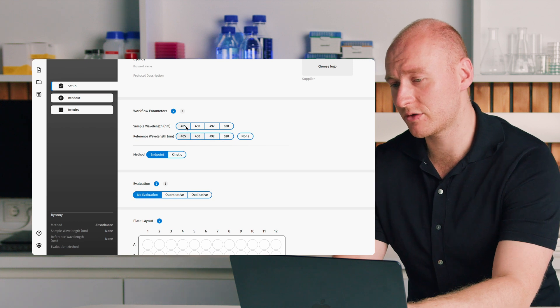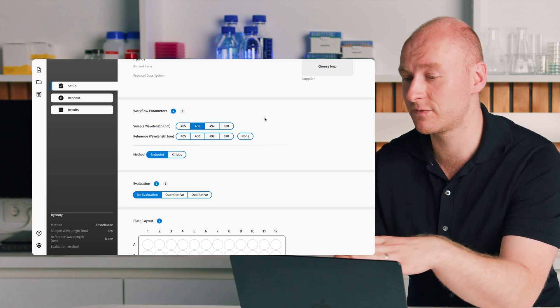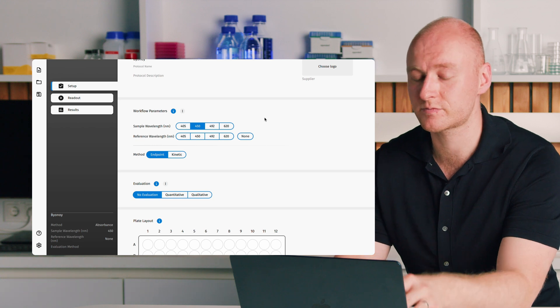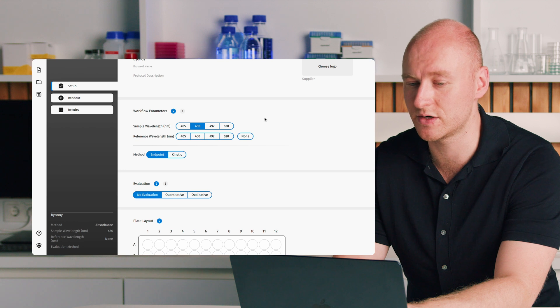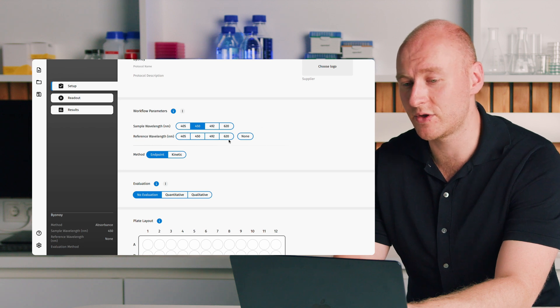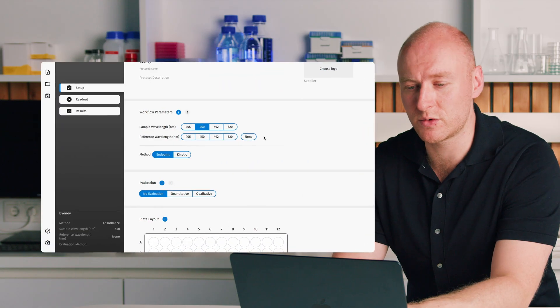This begins with your wavelength. Absorbance 96 has four different LEDs, allowing you to select four different wavelengths as seen here in the software. We also have the option to select a reference wavelength — a secondary wavelength whose measured results would be subtracted from those measured at the primary wavelength. For the purposes of the demo, we won't use a reference.